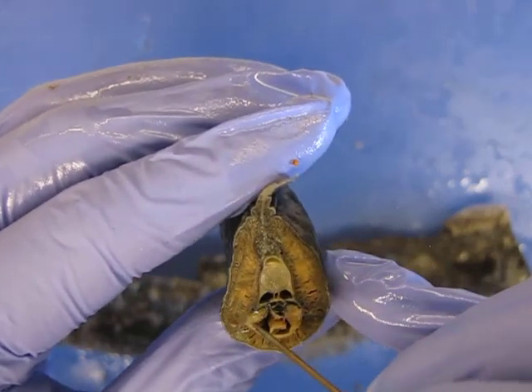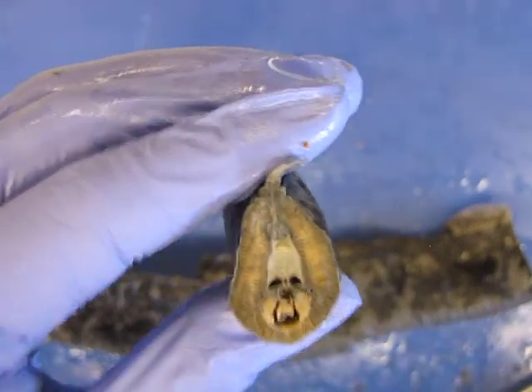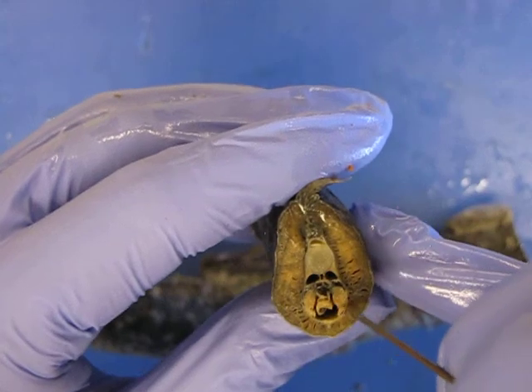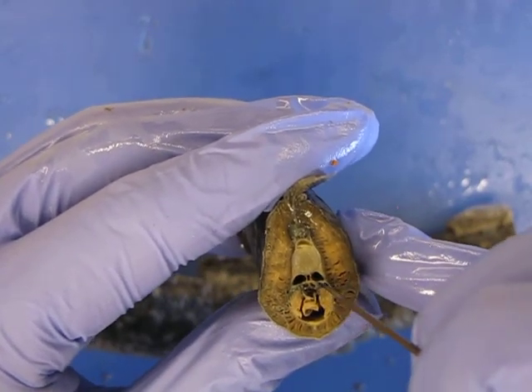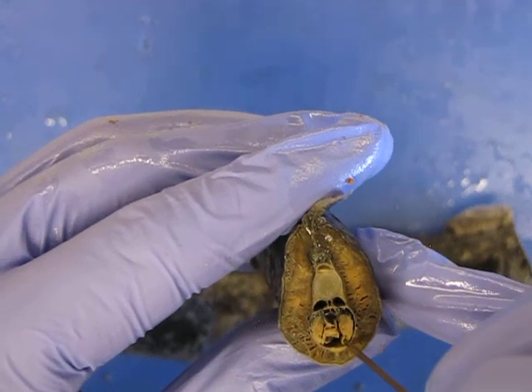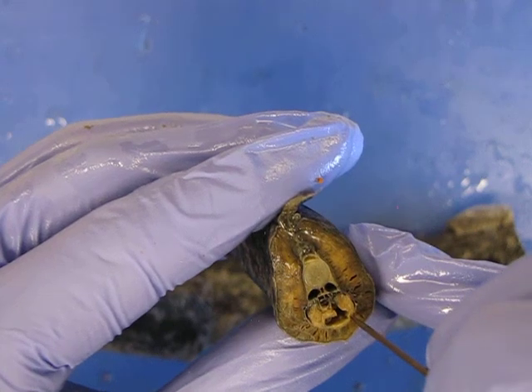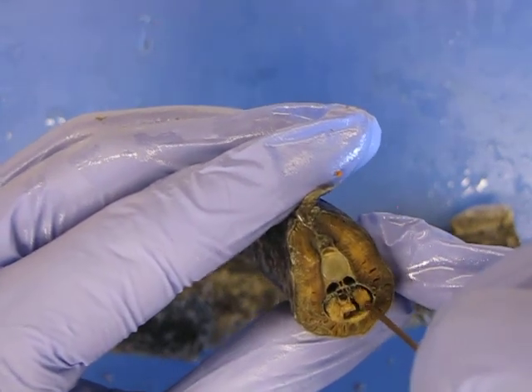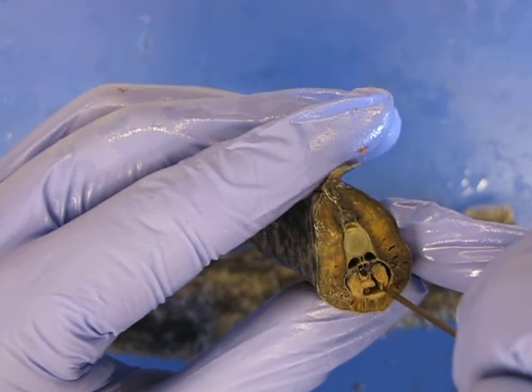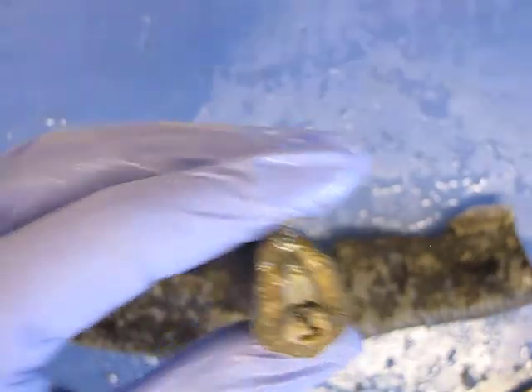See how they're kind of flap-like, kidney? And then the intestine is running down the midline there. Kidney on either side. Now note the shape of the kidney. Round flap, and then it's got this other flap down here. Remember we talked about that in the sagittal section. This is the archonephric duct. So if you very carefully put your teasing needle in there, you can see that it's a tube. So that's the tube that's draining along that ventral aspect of the kidney all the way down and out the cloaca.